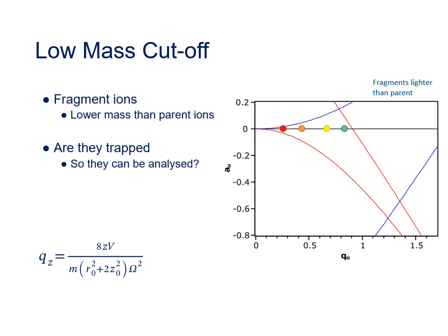Assuming your fragment ions are trapped in the ion trap, then you can collect a mass spectrum of those by using an RF ramp, the same as we explained earlier. Alternatively, if you need more in-depth structural information about a molecule, you can choose to isolate one of these fragments, and then fragment that into more fragments, isolate one of them, fragment them, and so on, until you get a deeper and deeper structural understanding of the analyte you're looking at. This process is called MS to the N, and we'll come on to that in a later session.